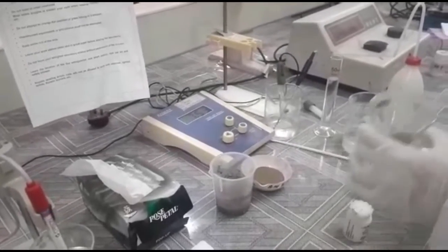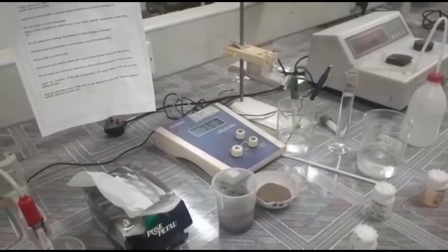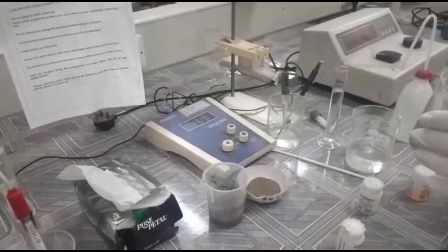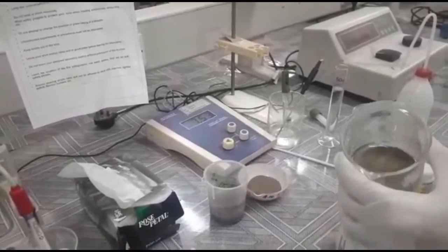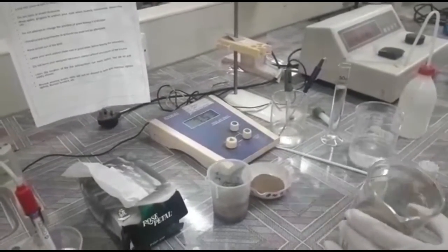Then we will make a soil and water mixture. There are different ratios we can use, usually 1 to 1 or 1 to 2.5. We need about 50g of soil, and we can add 100ml of water. We will stir and thoroughly mix.